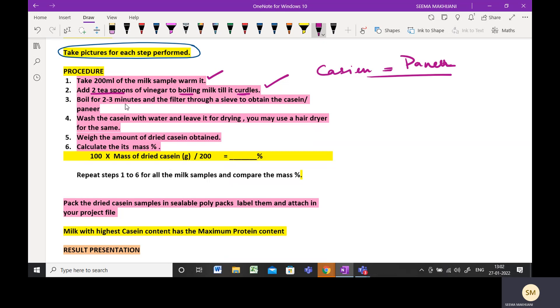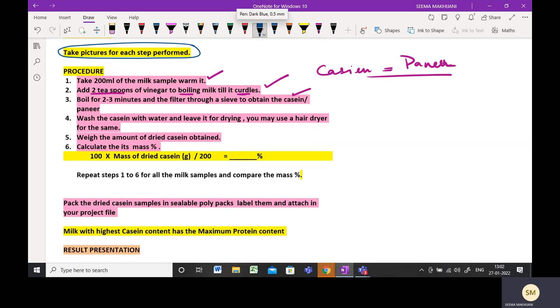Boil for 2 to 3 minutes and then filter through the tea strainer. You will get your casein collected. The casein obtained is then to be washed with water — add more water over it so that it is clean and there is no acid clinging onto it.